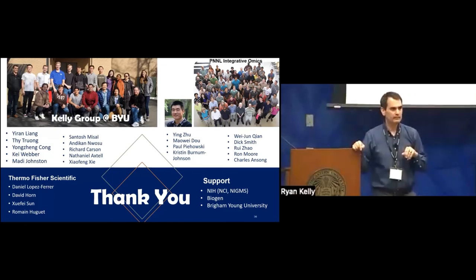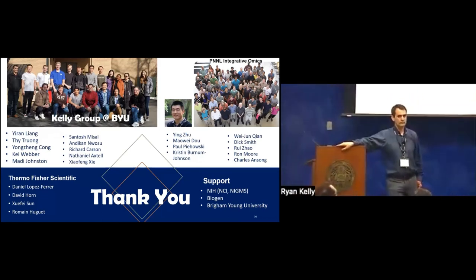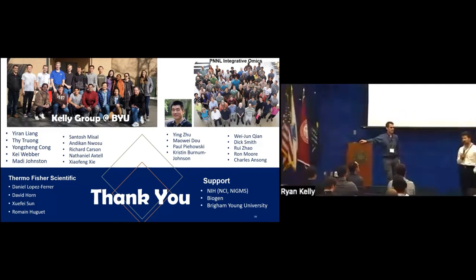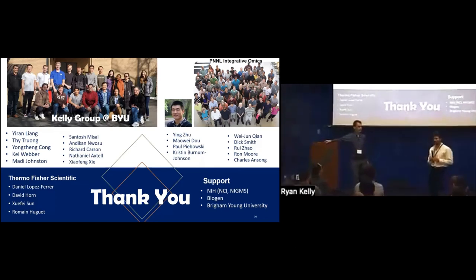So I want to make a comment. I agree with everything that Ryan said. I just have another thing that I would like to add, because I think matching between runs clearly has good potential to increase coverage, but it also has a great danger of making mistakes. And one additional thing that I think is very useful for us to do and to accept as a standard in the community is to prepare experimental samples in which in some samples we have proteomes of two species, in another sample we have only one species. And then you use those to estimate the false discovery rate.